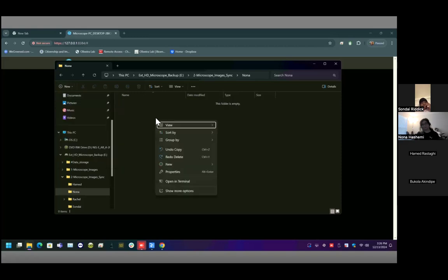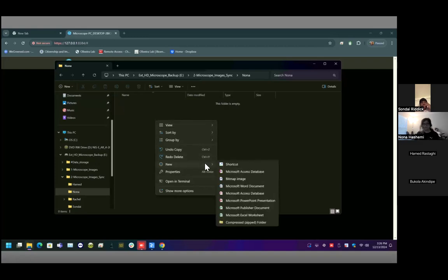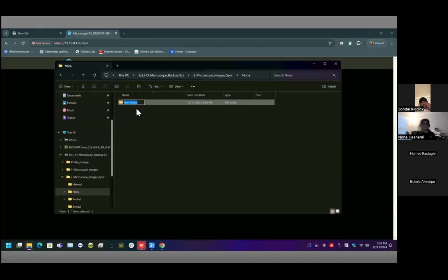You know what? I don't want to delay you, but you understand what I'm trying to do here, right? So, yeah, let me just create a quick folder here. Let me just name it this. Yeah.